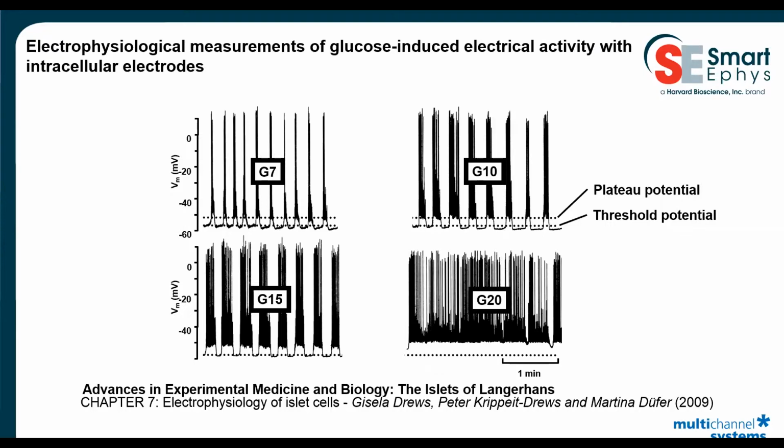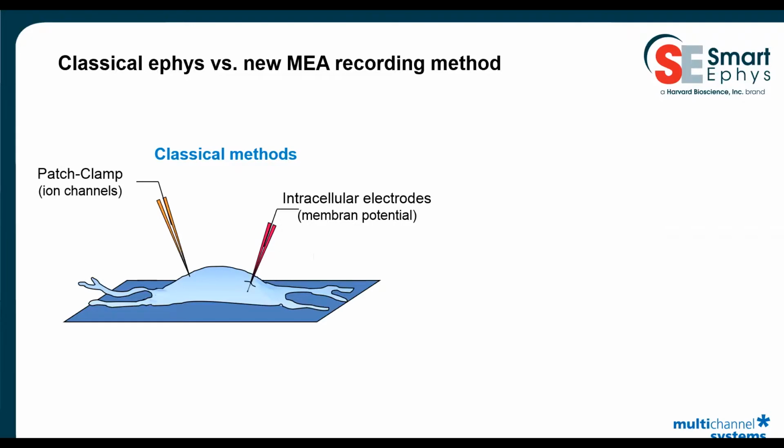Therefore, I would like to compare the classical electrophysiological methods with the new MEA recording methods. Because, of course, the question arises, why should we use the MEA technology for such recordings?